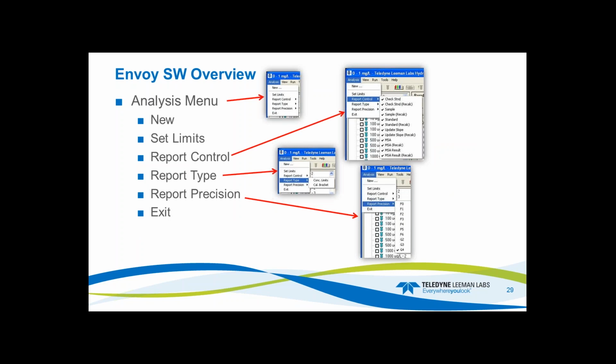On the analysis menu, the reports show up. This is where the concentration fields from the standards and the samples will be. You have new, set limits, report control, report type, report precision, and exit. On report control, check them all, because if you don't have them checked, those types of samples or unknowns will not show up in the report.